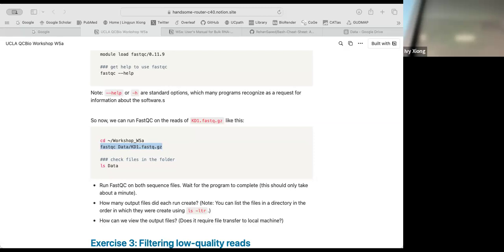Yeah, without your data folder, then you want to run. Okay. Just make sure that the path is right. Sometimes the software is like, where is the file? I'm not sure. That makes sense. Thank you.